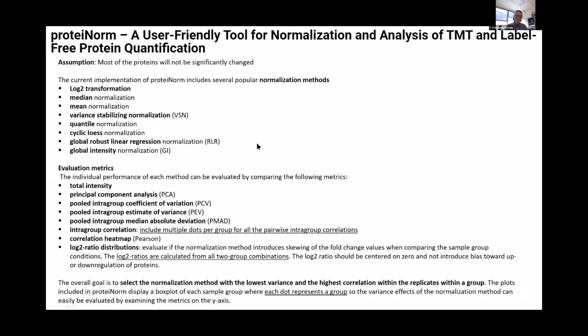So in the meantime, I'm just trying to look at the overall structure of this data. How are they correlated? What's the variability in the data sets? And then at the end, do those proteins make sense? Can you put the data that we see with other data that the researcher has? Is it making biological sense? And then we have to validate some of those.